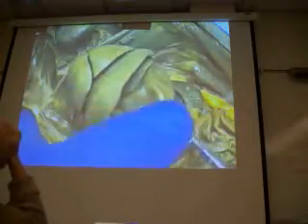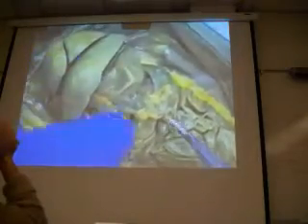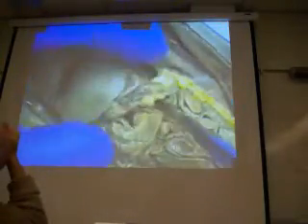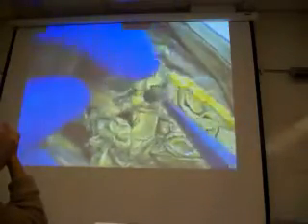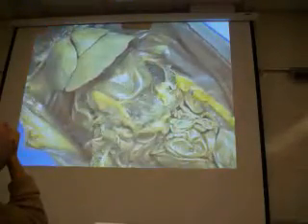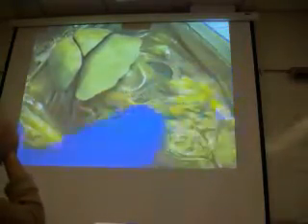Now the one thing that we're not really seeing a whole lot on this rat is the greater omentum. Okay. So you can see this fat that I'm kind of lifting up right here. You can see this other connective tissue stuff right here. This is the greater omentum. This is the belly fat that you don't want to get. Okay. Alright? So this is the greater omentum. And on some of the other rats, you'll really notice the greater omentum a lot. This one isn't so great looking.